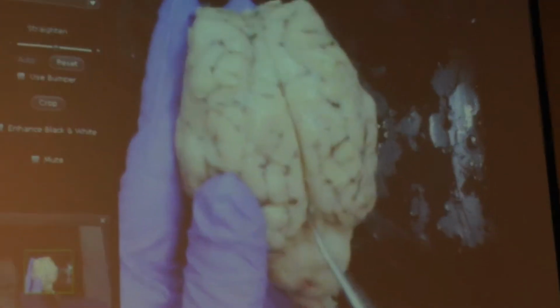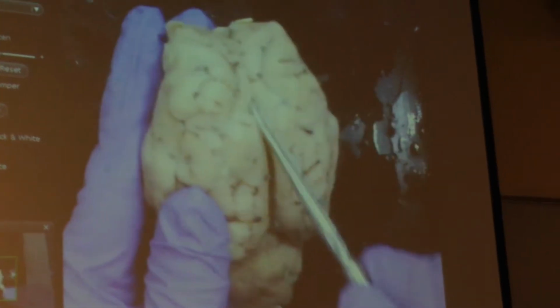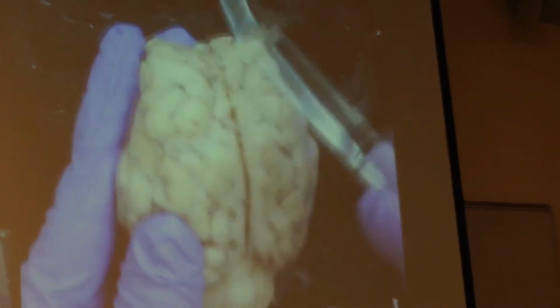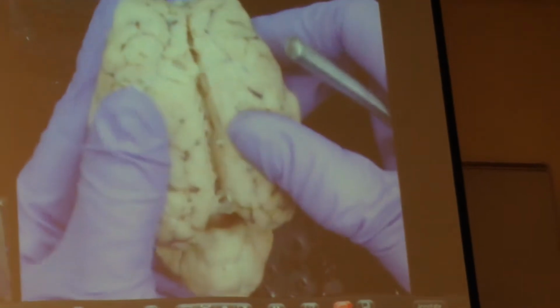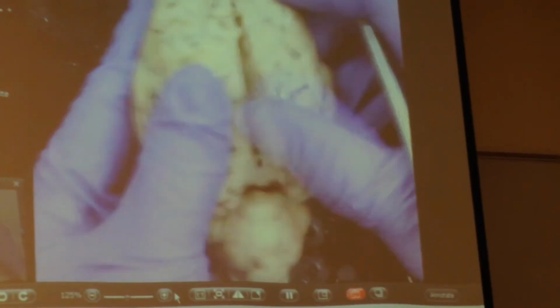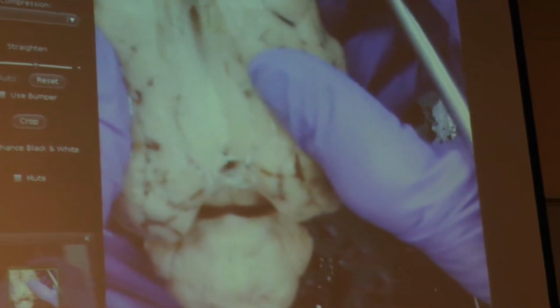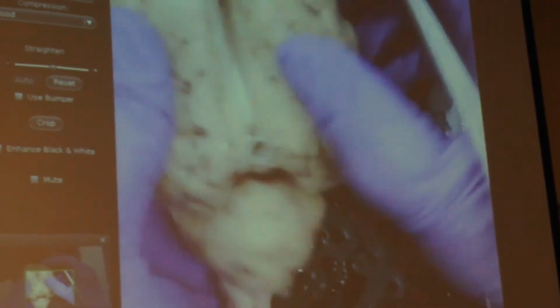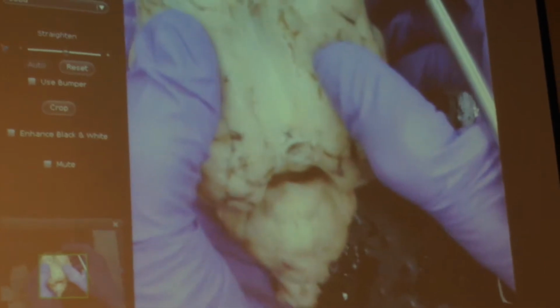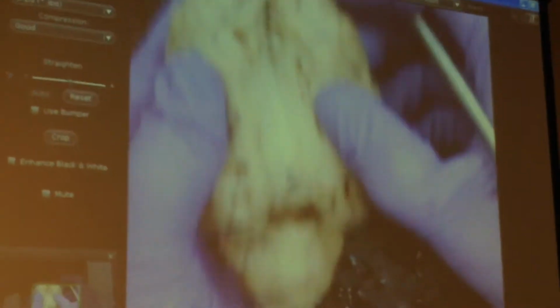And then if I turn this back upside, and then right here where this longitudinal fissure is, let's go ahead and pop through it like this through the arachnoid mater. And if I open that up just slightly, right here, if I open it and I look down the longitudinal fissure, can you all see right there that white substance? White matter or gray matter? White matter. I have a band of white matter going across. What is that? Corpus callosum. See how it goes across this way? Corpus callosum. Please make sure you observe that before you do your cut.